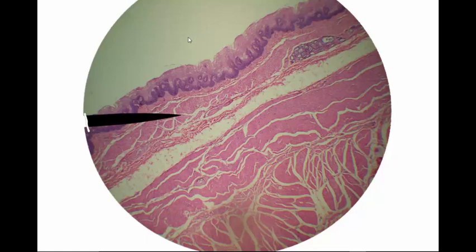This slide that we're looking at now, or this image, is from a section of human esophagus. To orient where we are, out here where I'm playing with the mouse, this is the lumen of the esophagus. This layer of the wall is the part that comes in contact with the food bolus as it passes by. This is called the mucosa.